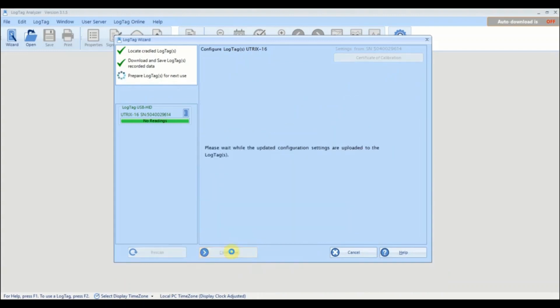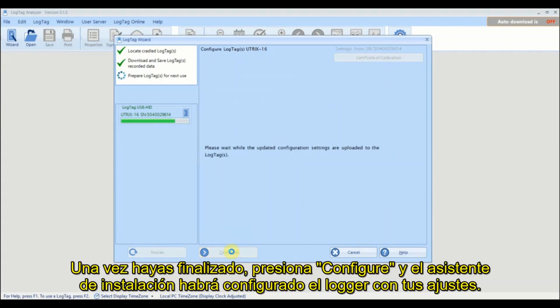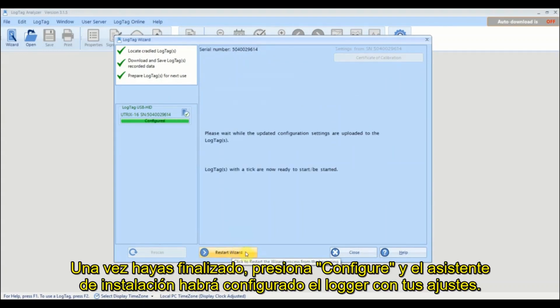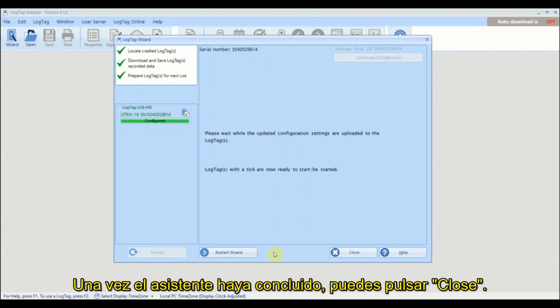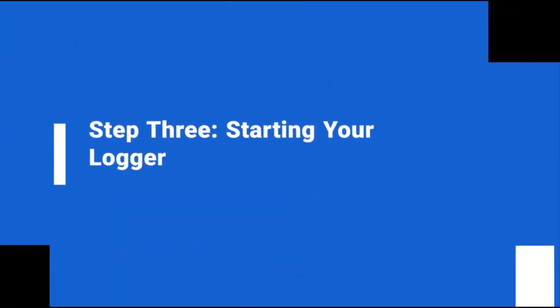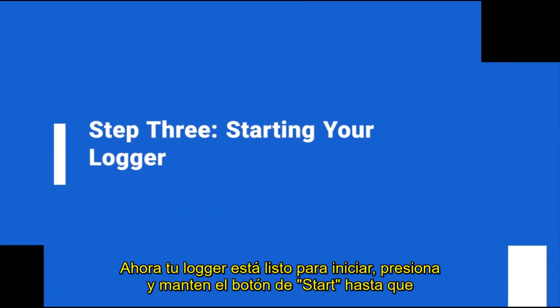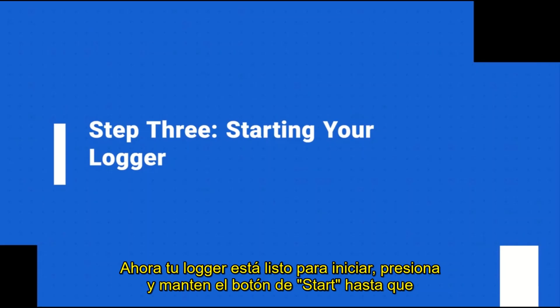Once you are ready, click Configure and the wizard will configure your logger with the settings you entered. Once the wizard has finished, you can click Close. Your logger is now ready to start.